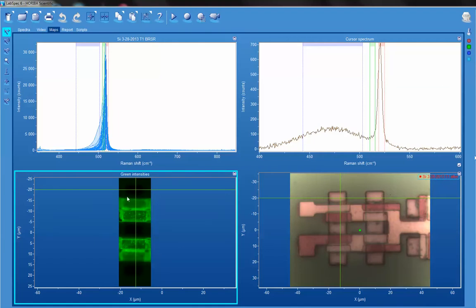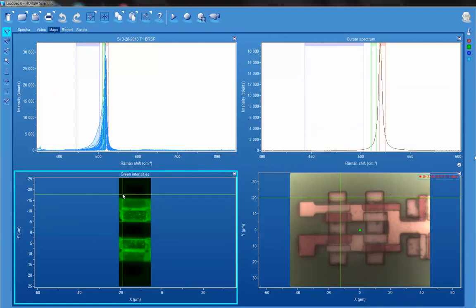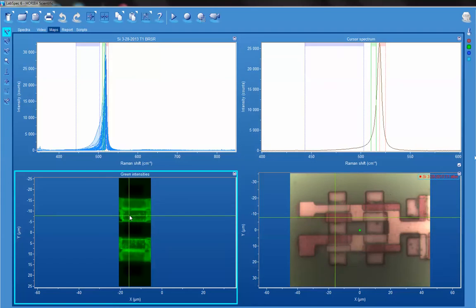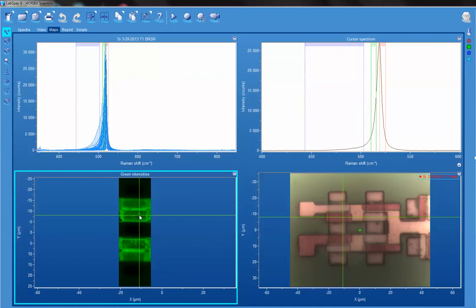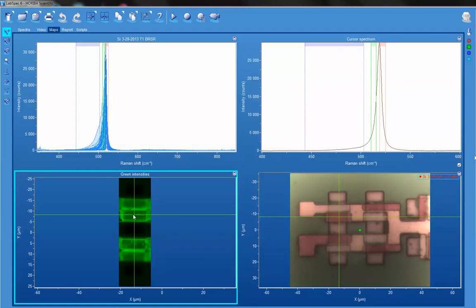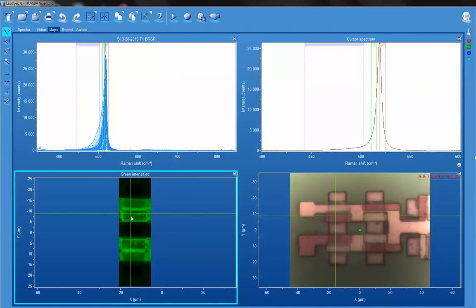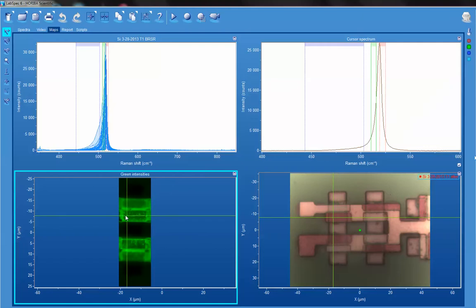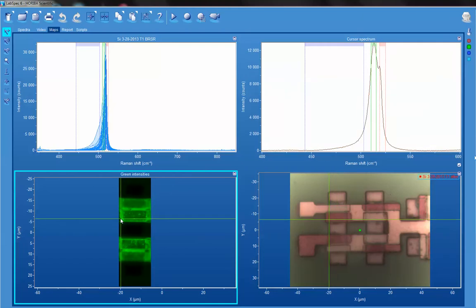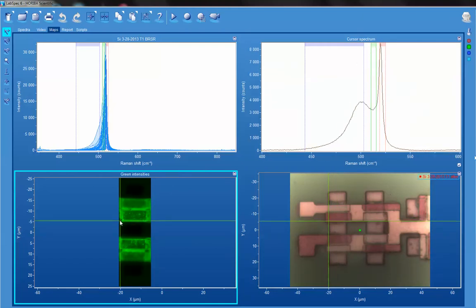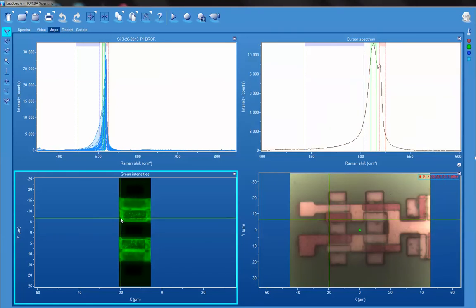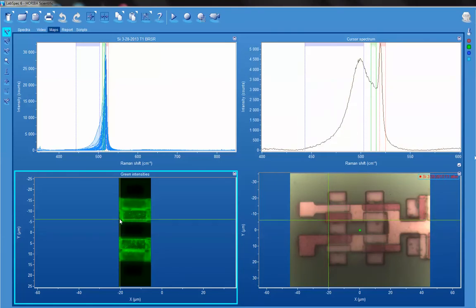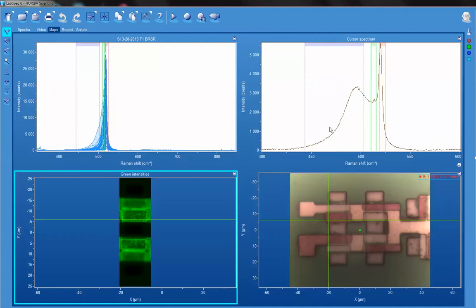Now we see essentially the polysilicon highlighted in our image. You can see these bright little flecks in the polysilicon that correspond to the same kind of pepper you see in the reflected light image. As we move to the edges, you can see substantial strain in the polysilicon at the very edge of the device, as manifest by this very strongly shifted to lower energy Raman scattering.